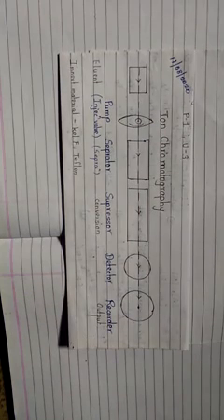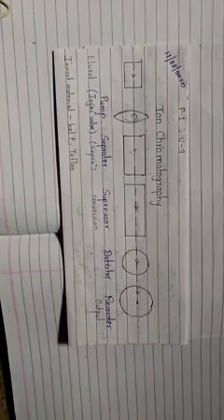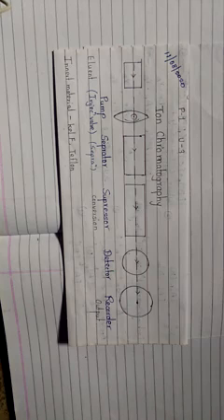Next is application. Here, as I said, separation of anions as well as cations. This technique is used in petrochemical industry for determination of sulfur compounds and in mining for analysis of inorganic ions and heavy metals.